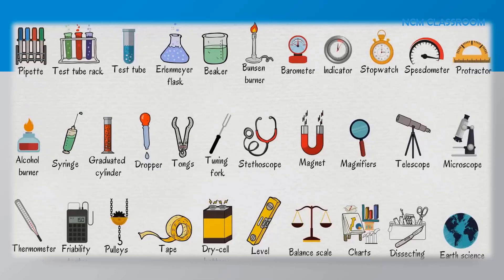Tape, Erlenmeyer flask, levels, etc. are used in biology laboratory.